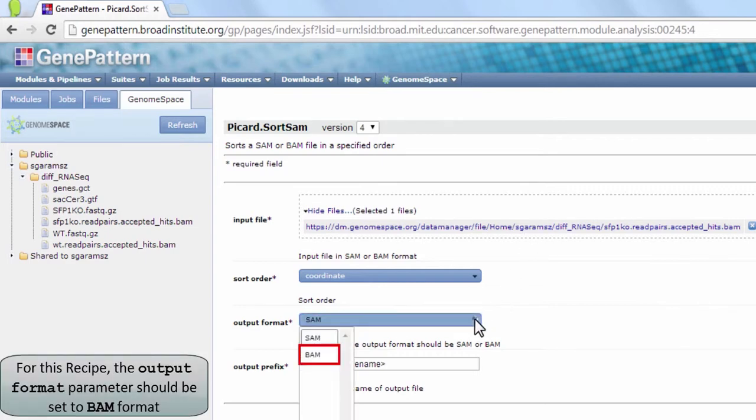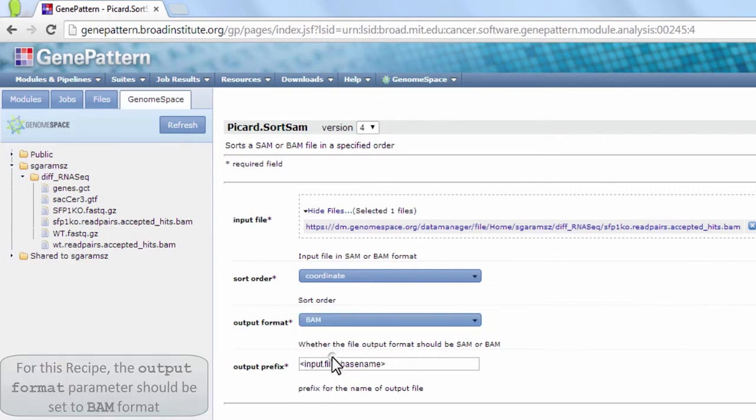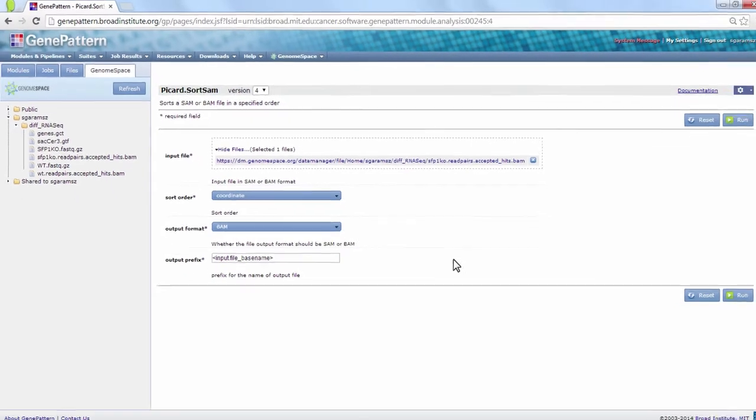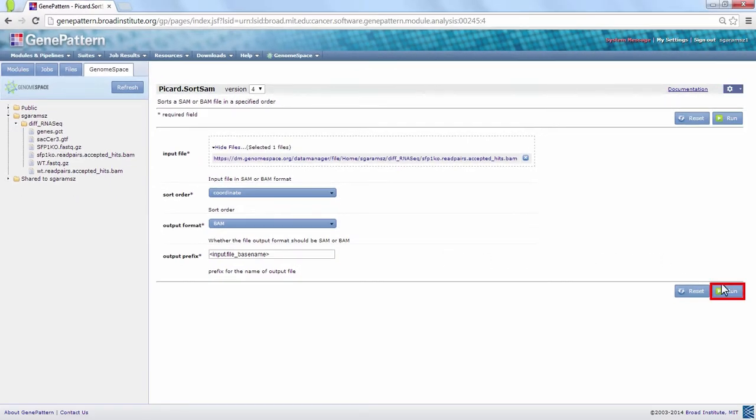In this case, we set the output format to BAM. Click Run to submit your job.